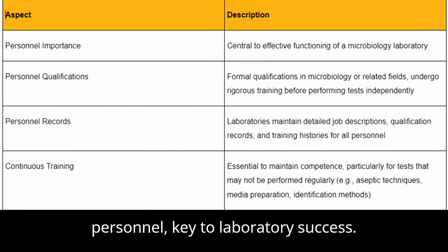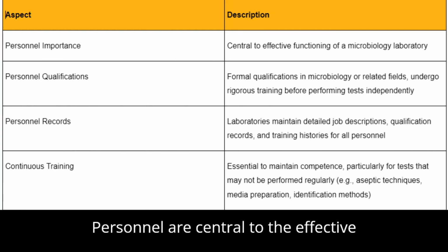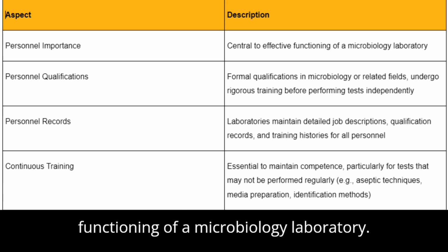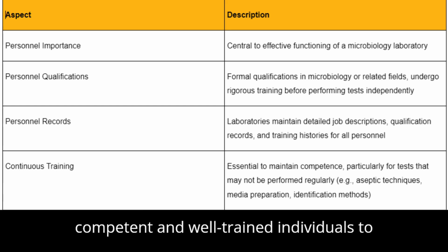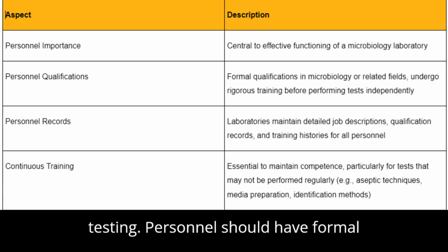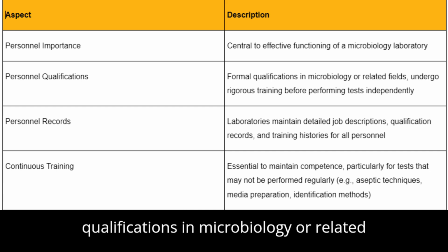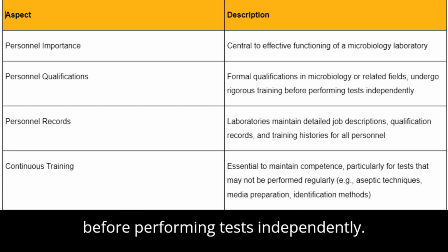1. Personnel, key to laboratory success. Personnel are central to the effective functioning of a microbiology laboratory. The document emphasizes the need for competent and well-trained individuals to supervise and carry out microbiological testing. Personnel should have formal qualifications in microbiology or related fields and must undergo rigorous training before performing tests independently.